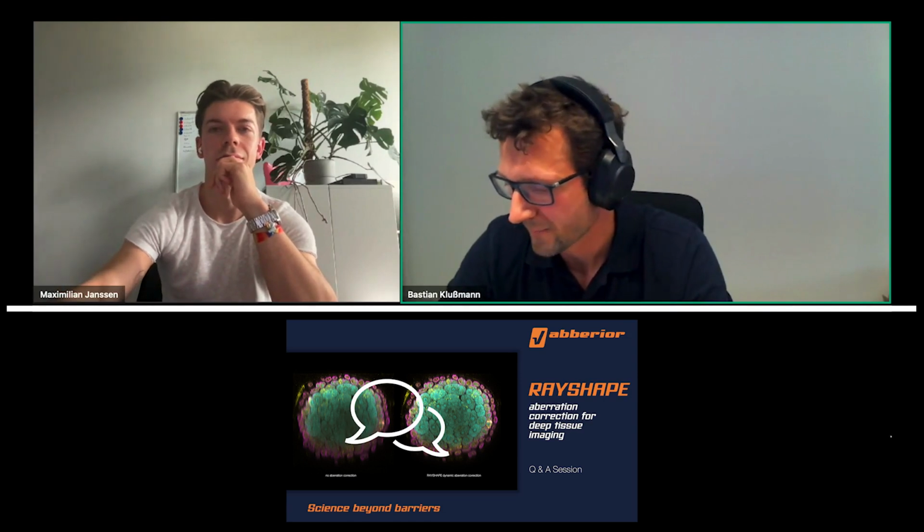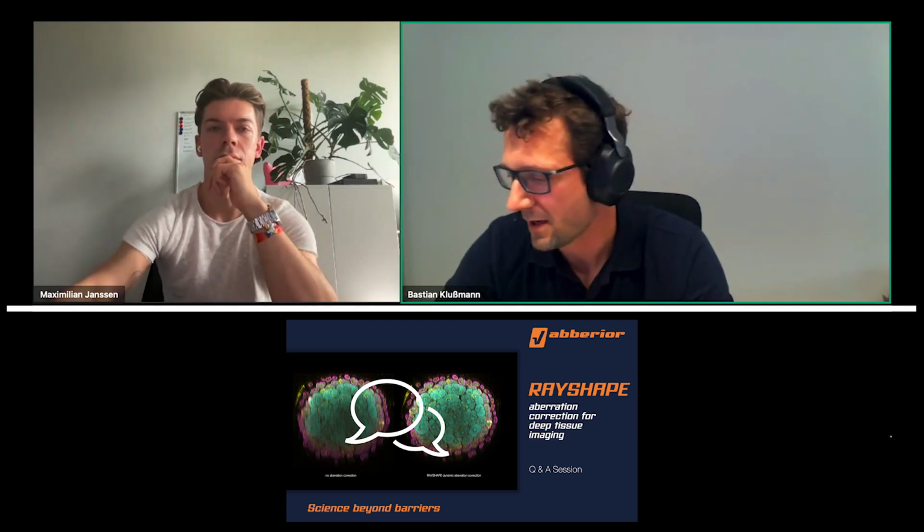Okay, and then the next one was the question if there is a difference between the Lightbox and the Inspector software. Yes, this is true. So our Lightbox software is easy to use, straightforward imaging software that normally runs in the foreground of our microscopes and is suitable for, I would say, 99% of all the imaging and most of the users. And there we optimize the settings for aberration correction, the RAYSHAPE, to be really straightforward and easy.